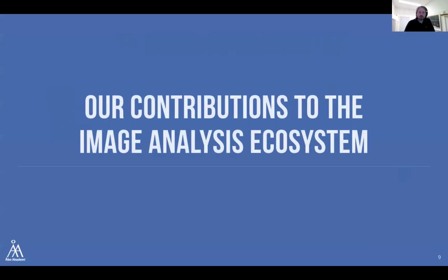So now what I want to do is to show you a little bit about some of the software tools that we've developed over the last 5 years or so. And I say we developed, but it's never been just us developing this software. It's always been in collaboration with others, and I will acknowledge them as I go through the presentation.